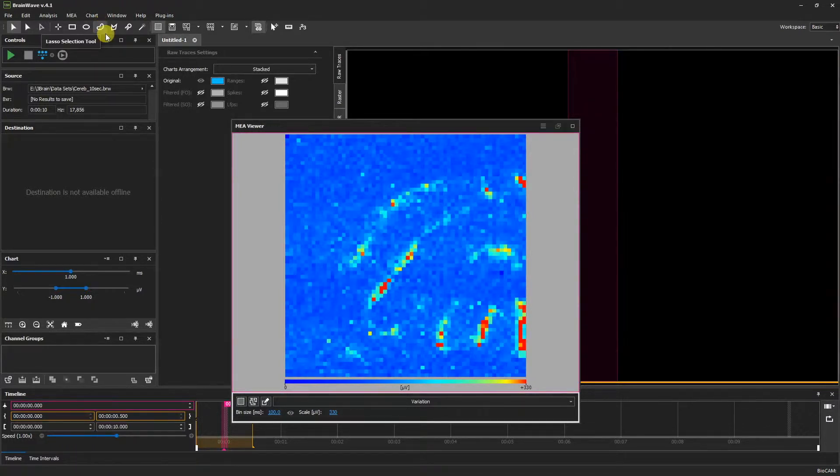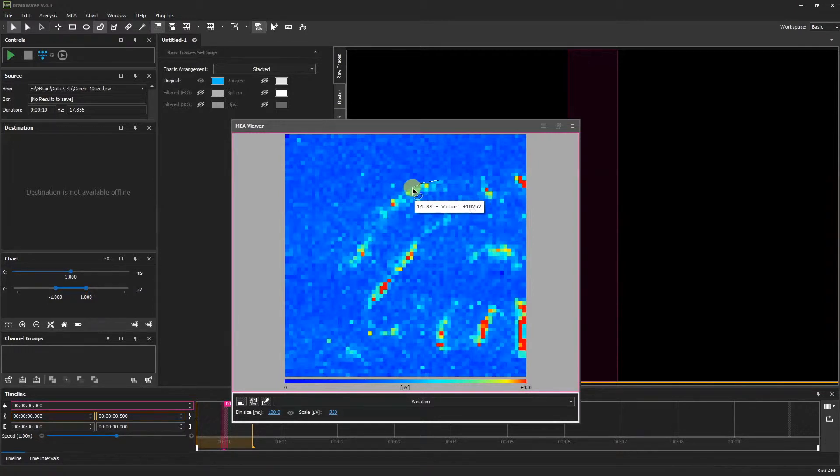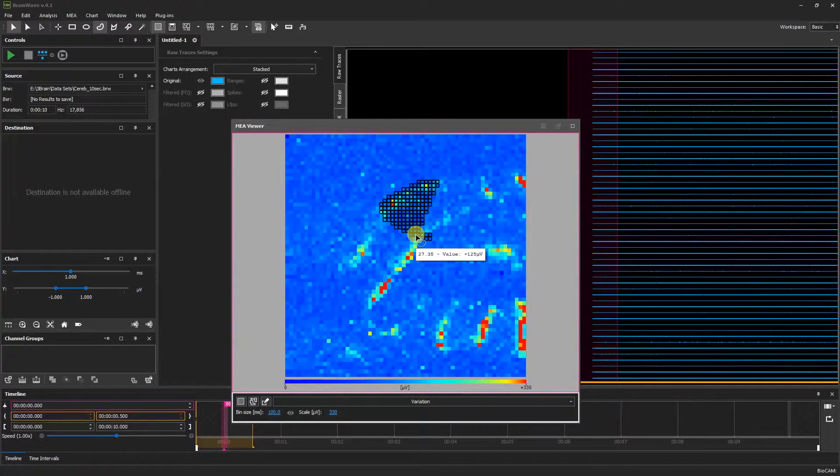We also have the Lasso Selection tool, which allows us to draw one line. By clicking and dragging, we see a lighter area representing the area that will be selected.